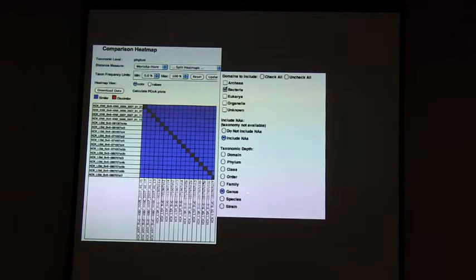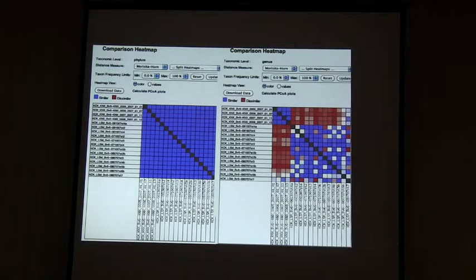On the other hand, we could come in and change the taxonomic level to genus, and the moment you do that with this set of data, you see that the samples change very much in terms of the heat map propagation. So blue, once again, these are all South Pacific Gyre samples. They're all essentially the same thing. And then we see the others, samples that are collected at different times, different stations, et cetera. So there's some variation in terms of what their similarities and differences are.